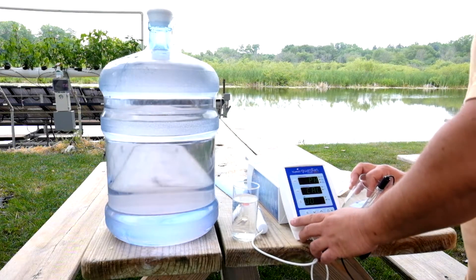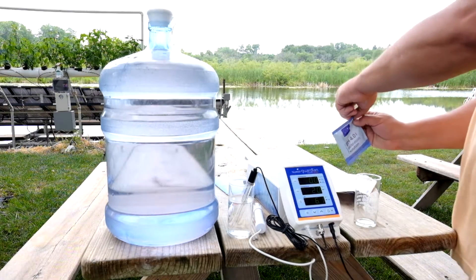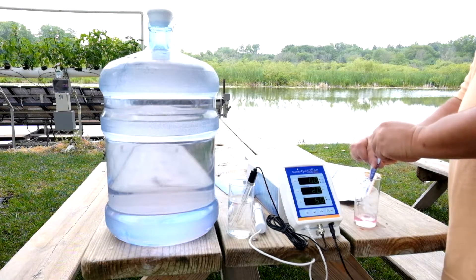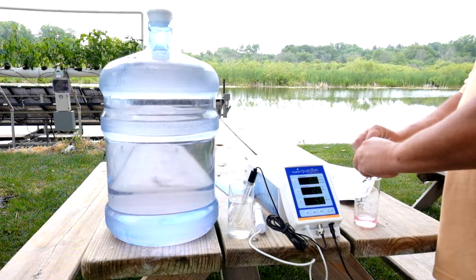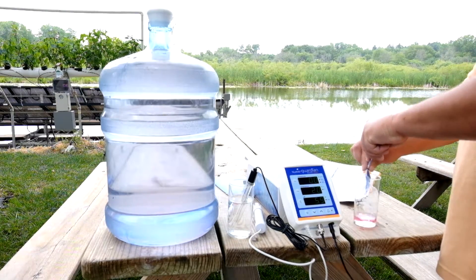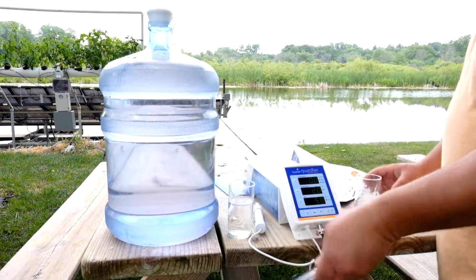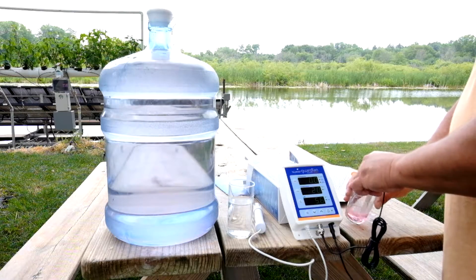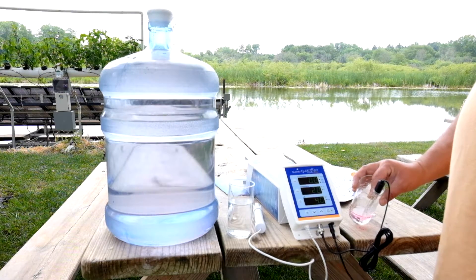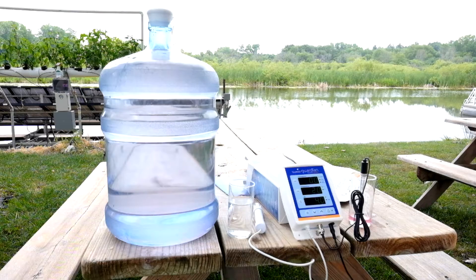You could probably do some customization, especially using Google Docs and setting up your own alerts, but they haven't done that themselves yet. Overall, this is a pretty nice unit. It's nice being able to have your total dissolved solids, temperature, and pH all in one unit. It just would have been nice if they expanded on the connectivity and the remote data logging. I know there are a couple other tools out there I'm probably going to take a look at. But I have to say their customer service was excellent in taking care of me, dealing with the unit that went bad, and getting me a replacement unit. Not enough companies do that these days.